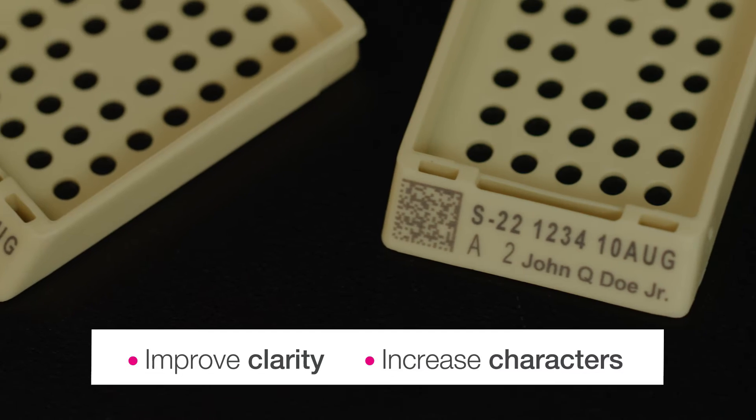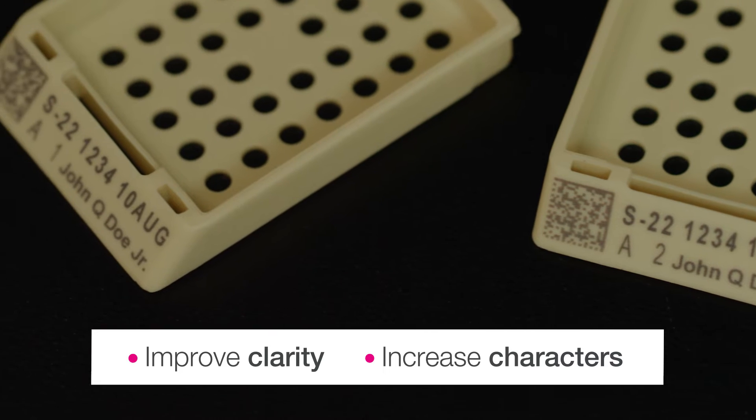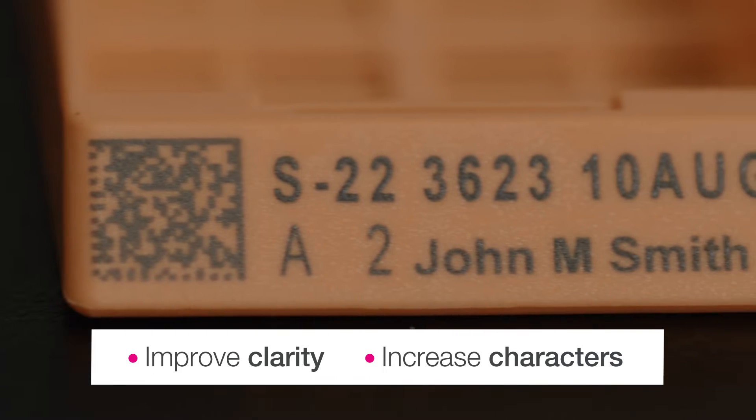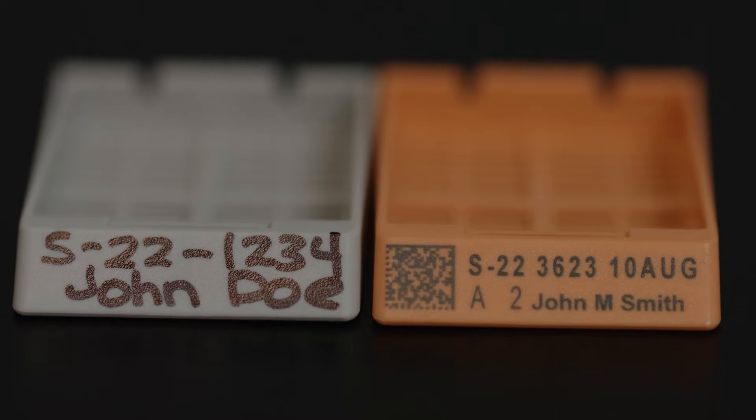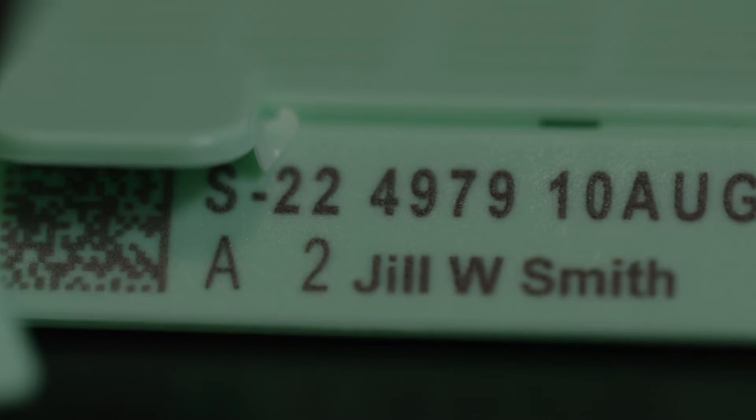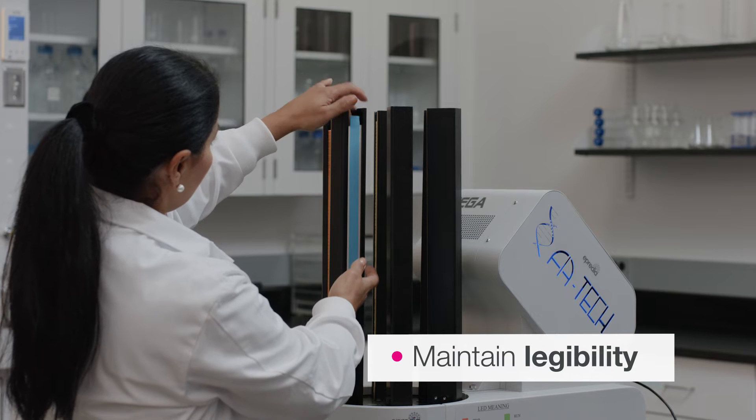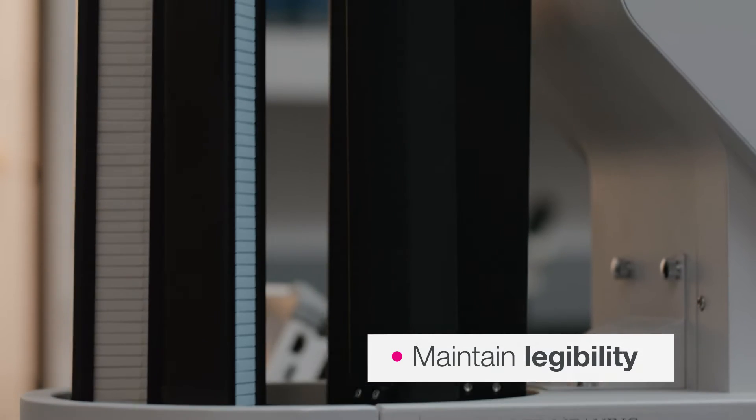Its 600 dpi printing improves the sharpness and clarity of characters, allowing more characters to be embedded and maintaining legibility, from grossing through archiving. Specialty cassettes help ensure permanent and indelible marking for high durability over time.